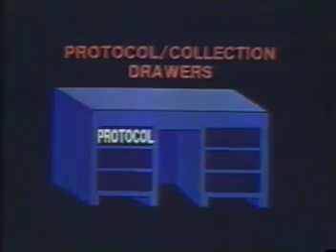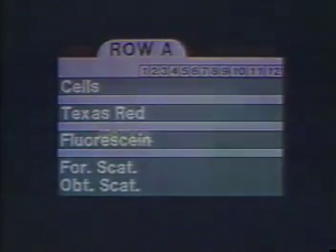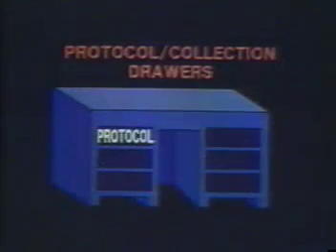In this drawer, you'll find a set of computer-style index cards labeled row A through Z. To prepare for data collection, you will fill in these cards by listing the parameters for which you will collect data and the names of the cells and reagents you will place in each sample. When you are ready to begin collecting data for an experiment, you switch your protocol drawer into collection mode.